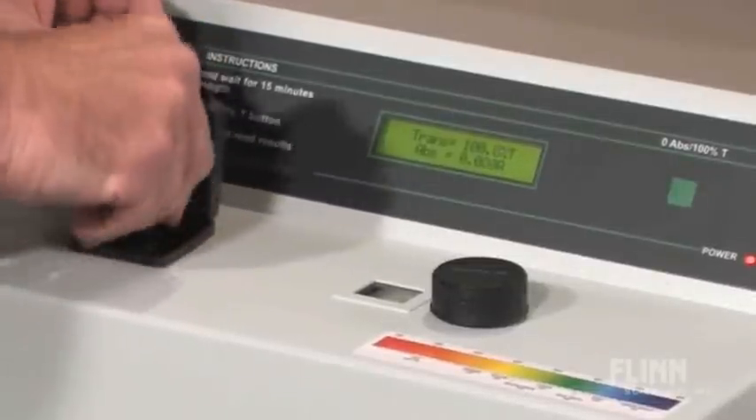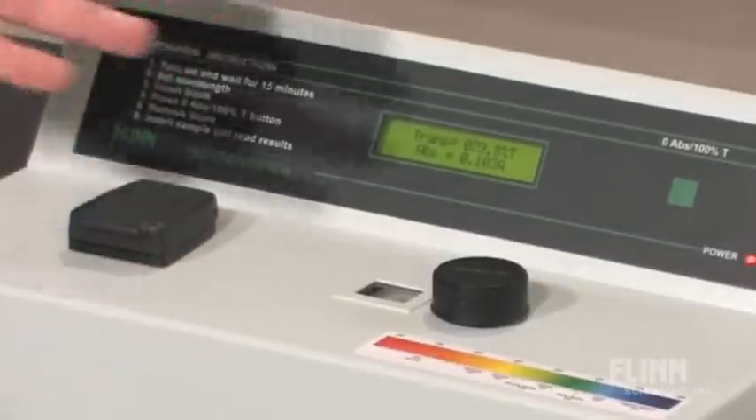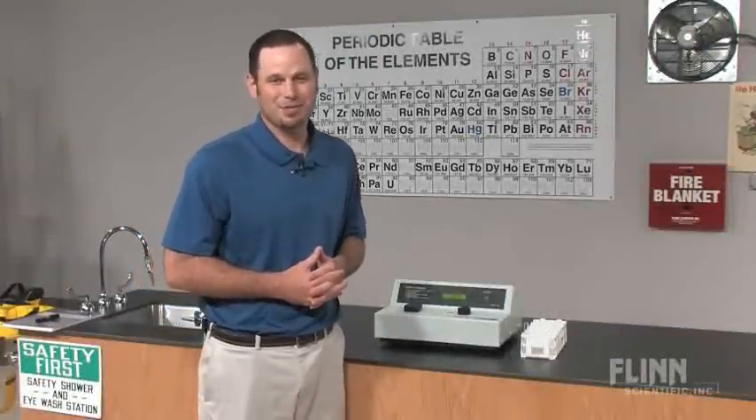Now you can remove the blank and insert your sample and record the reading. It really is that easy to use the AP7026 Flynn Scientific Spectrophotometer.